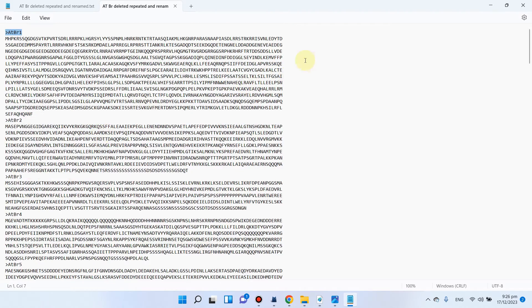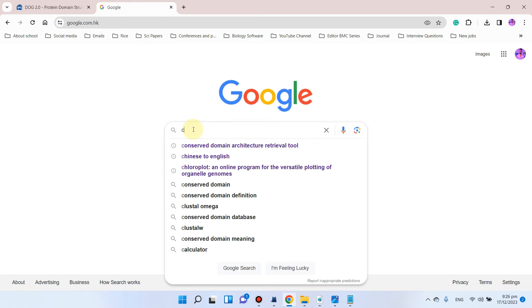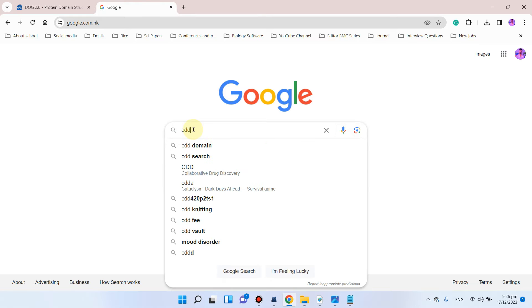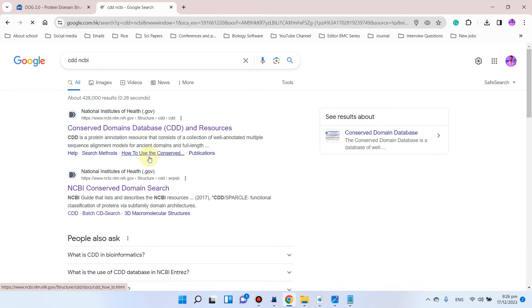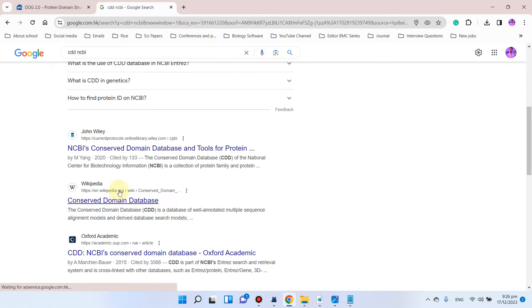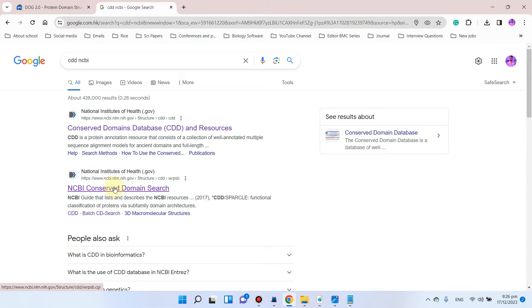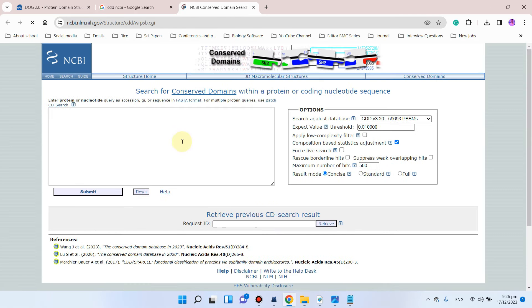To create the domain architecture analysis, first we need to go to Google and search for 'CDD NCBI', which stands for Conserved Domain Database on NCBI. We simply click on this and open the NCBI conserved domain search.